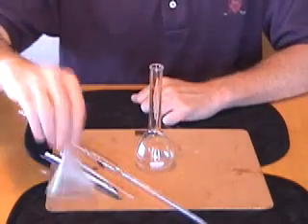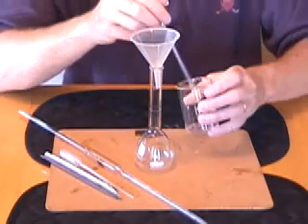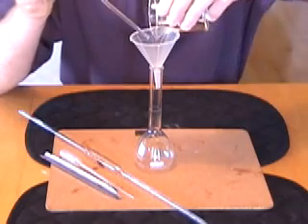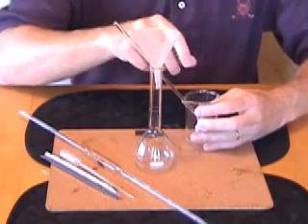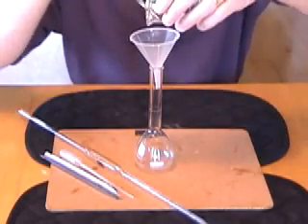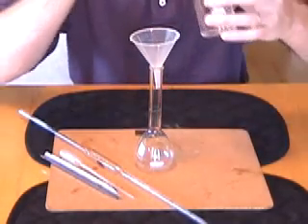Now, what you want to do is then get a funnel and be able to transfer the solution that you're starting to prepare in here through the funnel into the flask. Make sure that you get what we call a wash bottle or some beaker full of water here, and rinse off the stirring rod and the beaker. Put that into the volumetric flask. Rinse it off again, because if you wouldn't lick it, it's not clean.